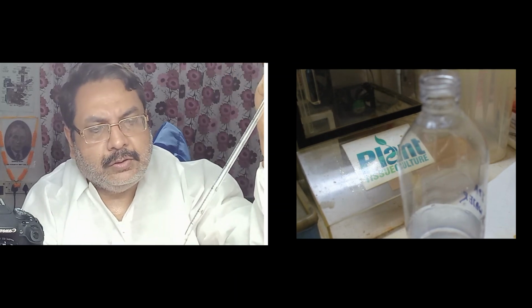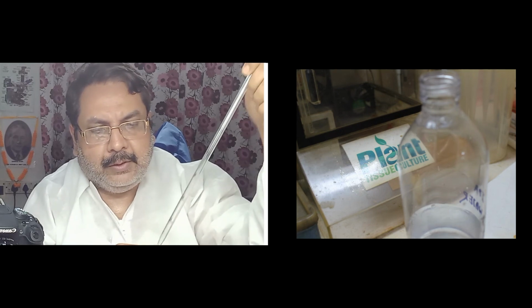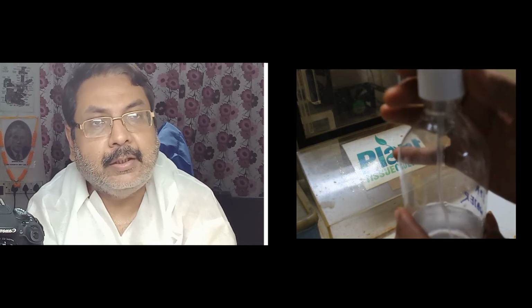Pipette is also used. You just have to keep it in a sterile enclosure. And this is the auto pipette. Sterile auto pipettes and sterile pipettes are also available, and these auto pipette tips are also available. They are available in boxes, about 1000 tips or 500 tips or whatever.